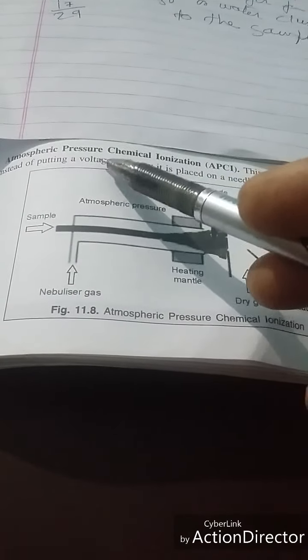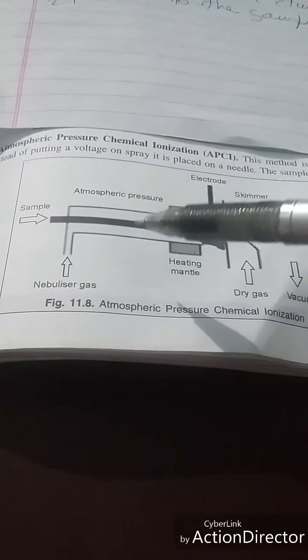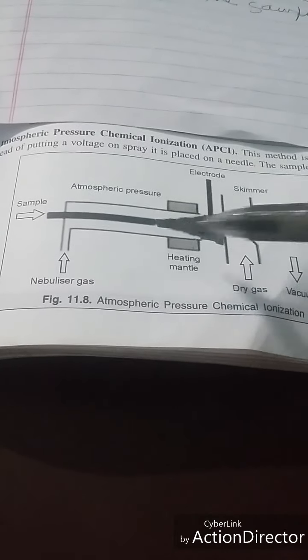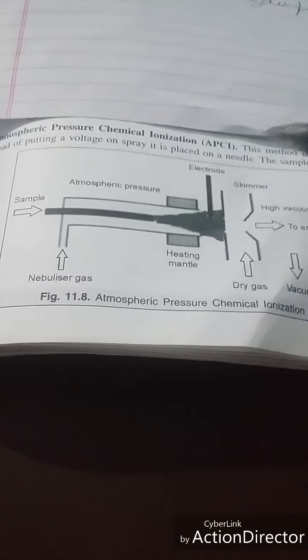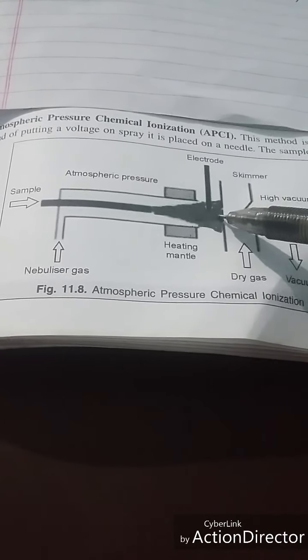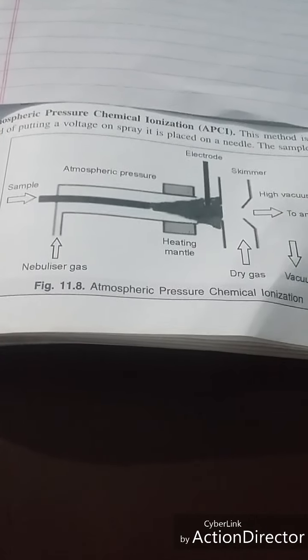Next is atmospheric pressure chemical ionization. This method is similar to electrospray ionization, but instead of putting voltage on the spray, it is put on the needle. The sample is injected into the discharge by a spray created by the flow of liquid in the presence of heated gas that will vaporize the sample, and the ions are produced in this case by proton transfer from hydronium ions or water clusters to the sample, and then they move to the analyzer.